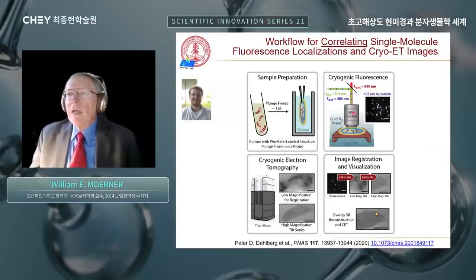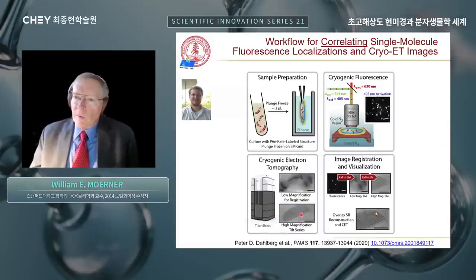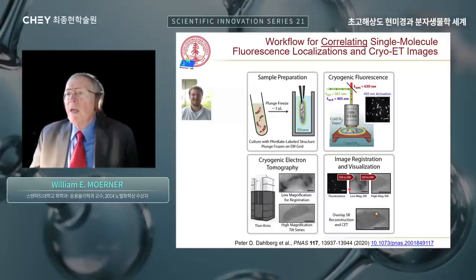Then we take that sample and place it on a low temperature microscope that works at 77 K. The liquid nitrogen cools the grid and keeps the grid frozen throughout the entire experiment. But then we can use light to pump the single molecules that are in these cells and collect the fluorescence coming back. If they're photoactivatable, we can turn them on at low concentration, and we can measure the positions of the single molecules. And then we take that frozen grid and keep it in liquid nitrogen and load it in these electron microscopes. Pete records low and high magnification images, then registers the two images, fluorescence to electron microscopy, so that you can place spots showing where the fluorescence is located in the cryo-electron tomogram. So that's the basic idea for this work.